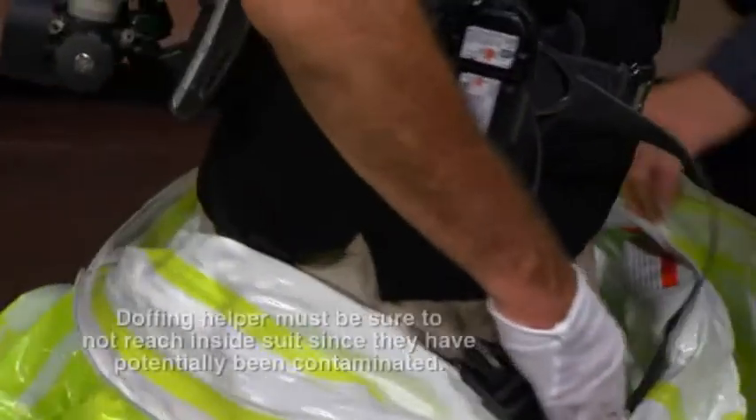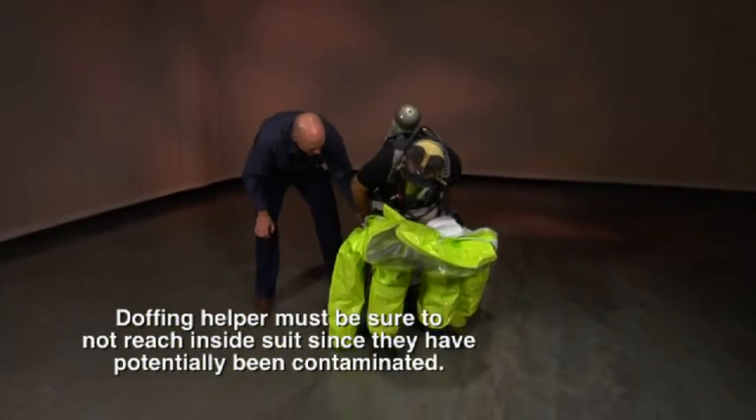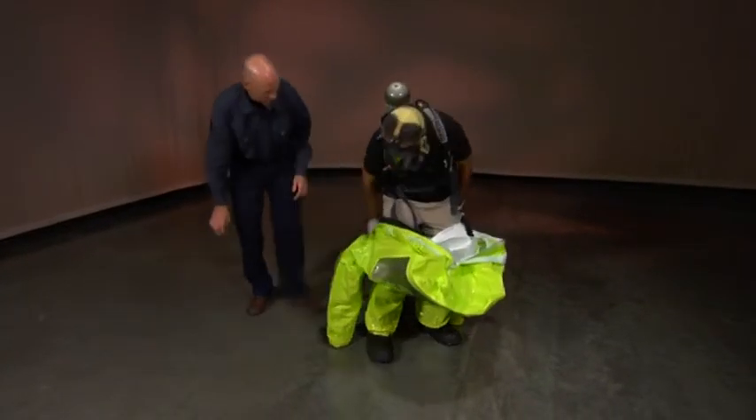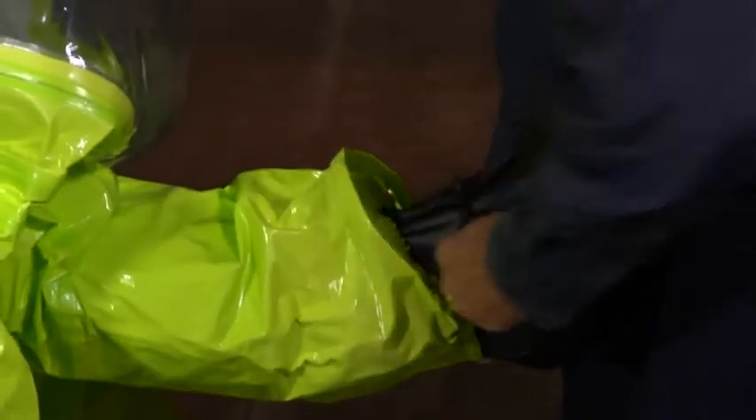Continue rolling the suit inside out to below waist level at mid-thigh. Have the wearer sit down on a no-back stool or bench. Assist the wearer to remove chemical boots and move them to the side.